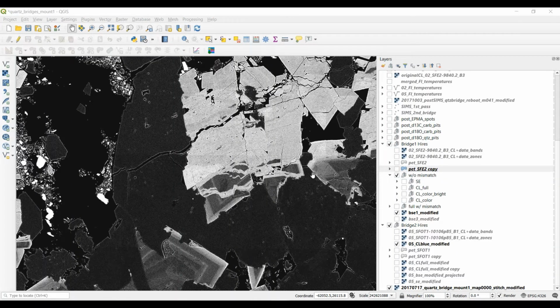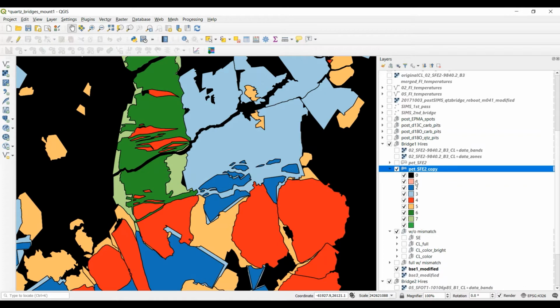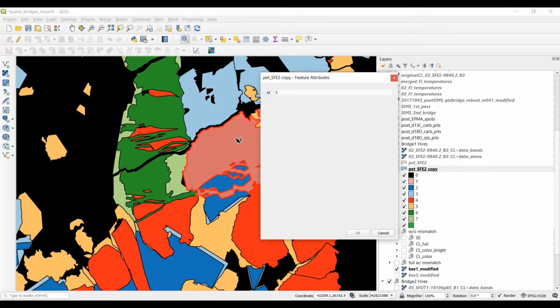In these videos, we've talked a lot about saving point data as shapefiles, but shapefiles can also be used to save lines or polygons. Now, one particular use of polygons for the microanalytical community is to create essentially petrographic phase diagrams, such as this. And the great thing about this kind of approach is that one can create polygons and associate metadata with those polygons, and then color those polygons according to what petrographic phase has been assigned to them.